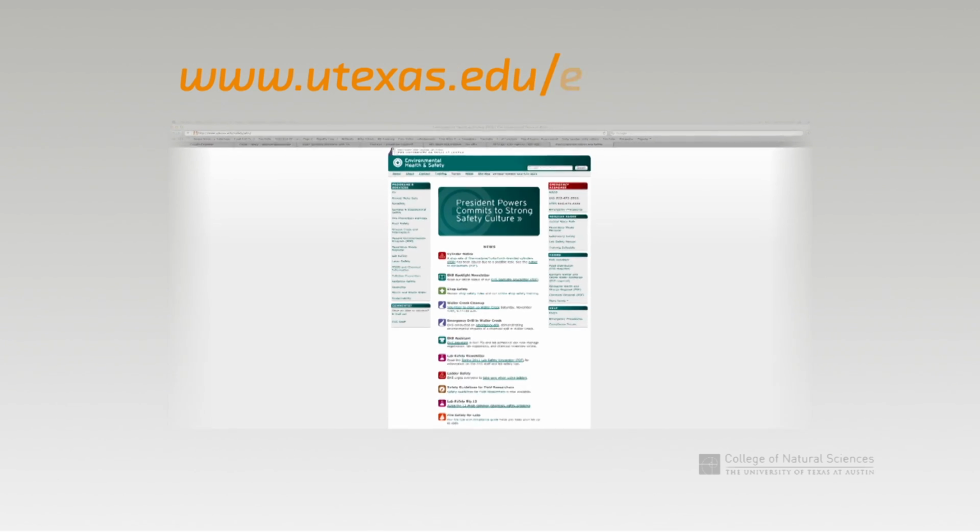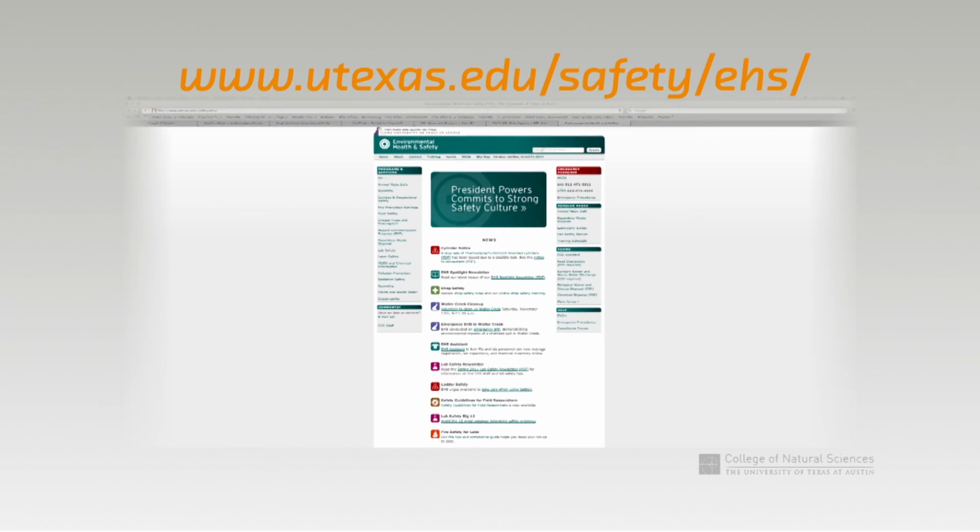Many accidents in lab happen because students are rushing. The best thing you can do to prevent this is by coming to lab prepared. Material safety data sheets, which contain information about chemical hazards, can be looked up before coming to lab, and procedures should be thoroughly reviewed. Also, consult with the TA or instructor if you are not familiar with the hazards of the chemicals you are using. I can't emphasize enough how being prepared will save you time and reduce your stress in lab.